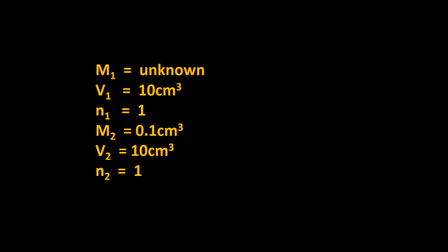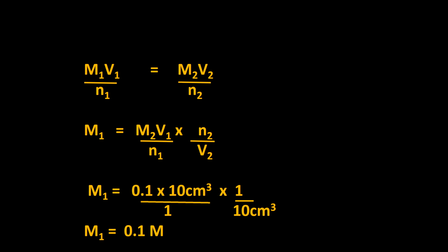Till now, how many headings have I discussed? I have discussed material required, chemicals, procedure, chemical equation, observations, and then calculations. So all these headings will carry marks. In totality, the whole practical will carry 30 marks.